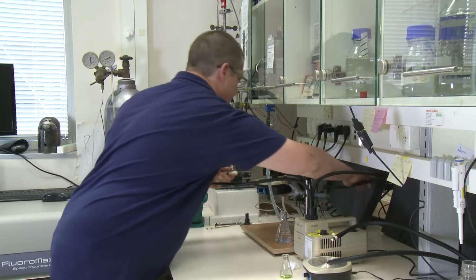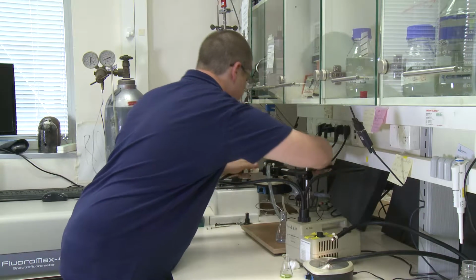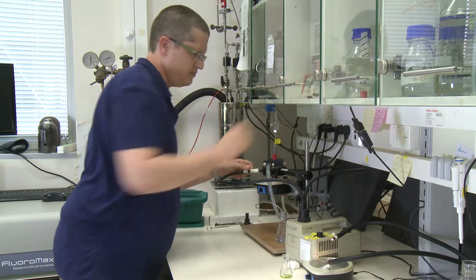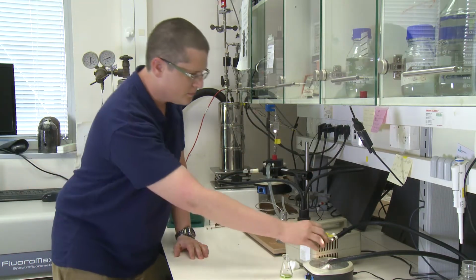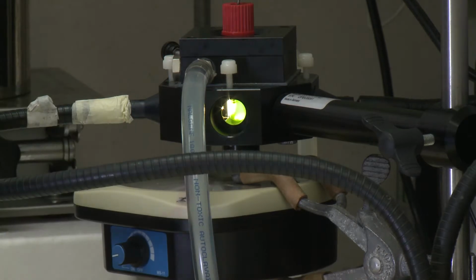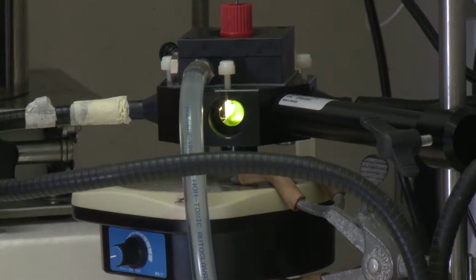And what about the light? So now he's inserting the light, as you can see. Is that a very strong light source? Yeah, it can go up to the same intensity as the sun. We measure light in the intensity of the sun. In order to honor Albert Einstein, we call it an Einstein unit. So the intensity of light is in micro Einstein, and sunlight is 2000 micro Einstein.